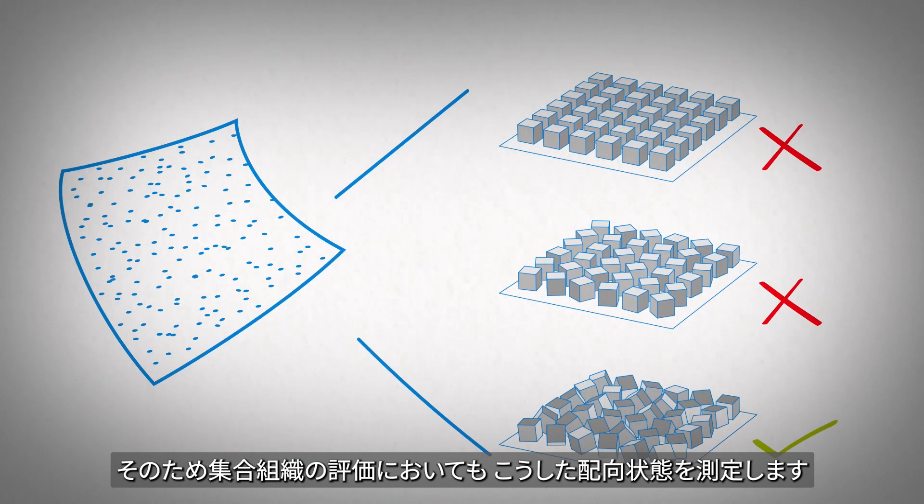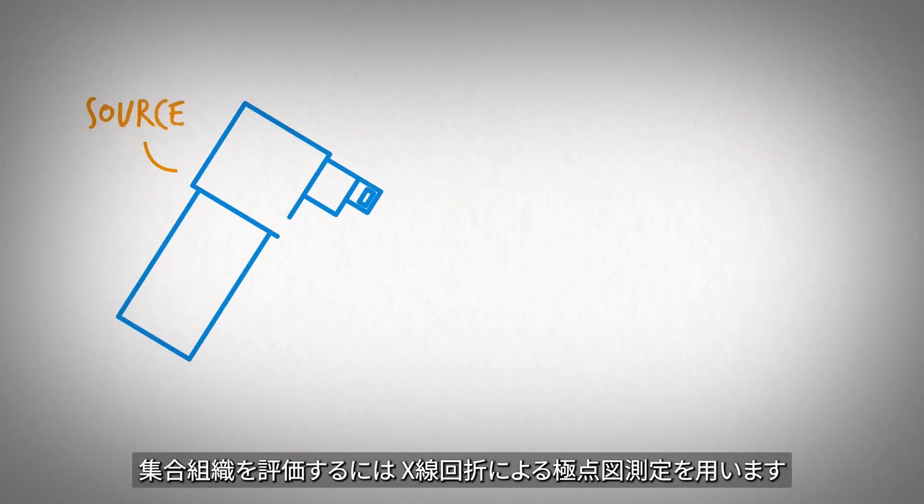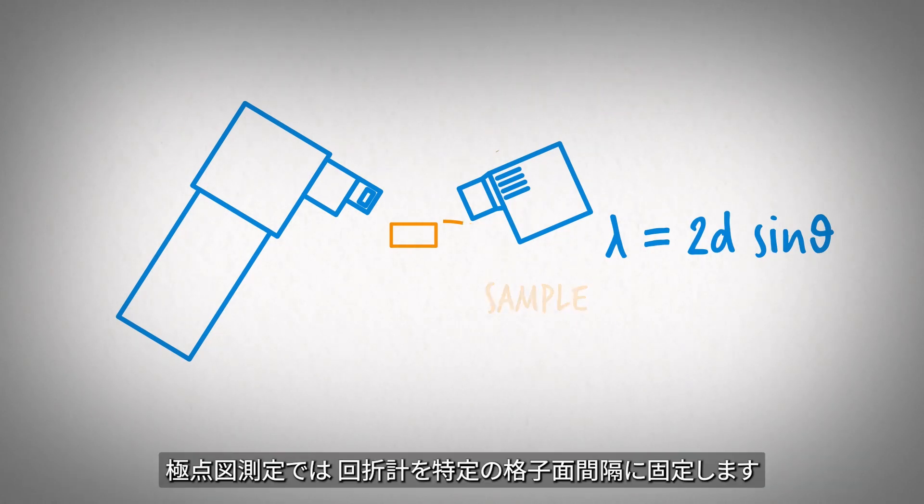The orientation of crystals is what's measured in a texture experiment. In order to measure the texture of a material, X-ray diffraction is used. X-ray diffraction is a technique sensitive to the atomic distances in a material. In a texture experiment, the instrument is locked onto a single atomic spacing.